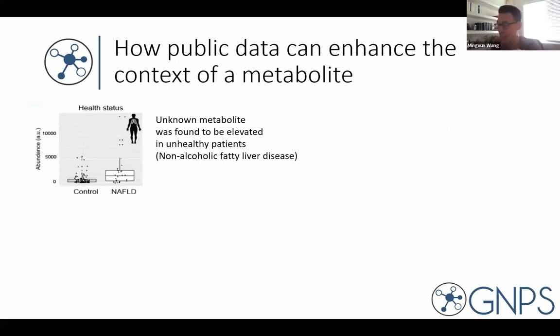was one particular tandem mass spectrum that we studied in a human data set. This happened to be human stool. We didn't know what the actual molecule was at the time, but what we did know was that it was overexpressed in patients that had non-alcoholic fatty liver disease as compared to healthy patients. So this is something we detected in the stool.